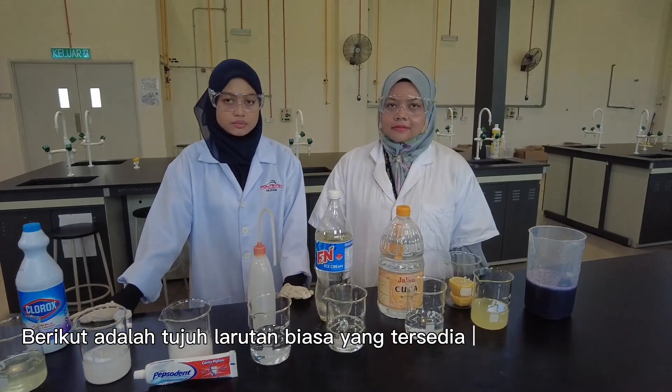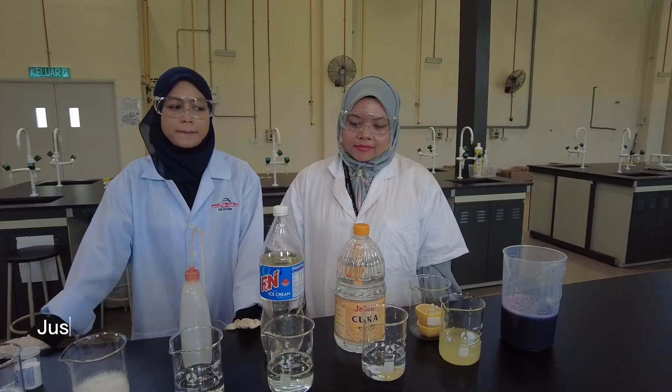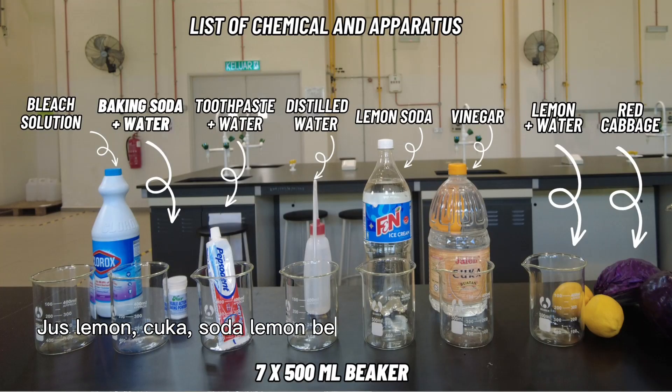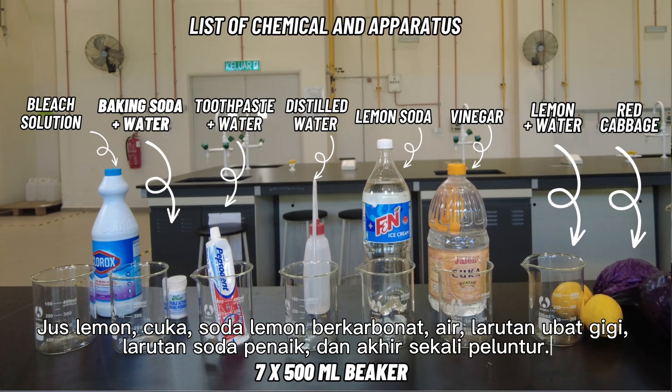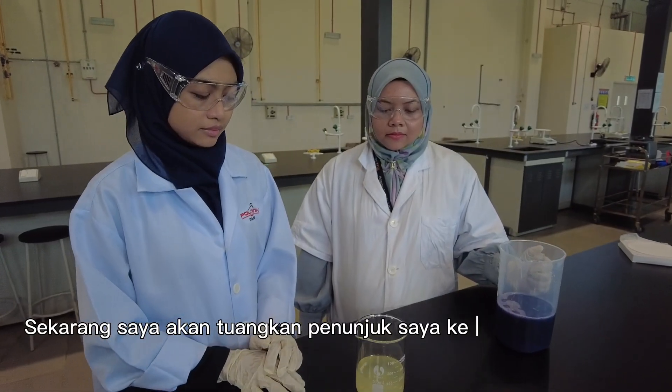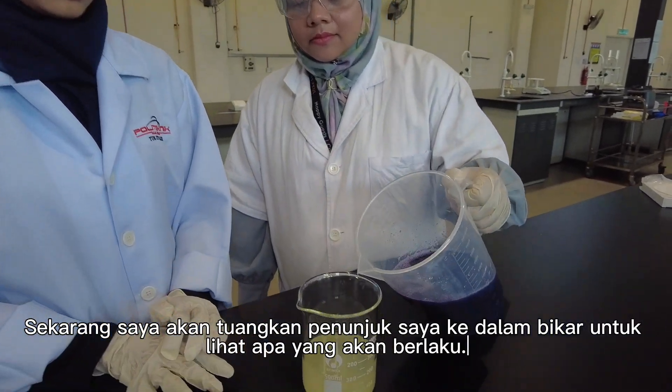Here are 7 commonly available solutions that we are going to test: lemon juice, vinegar, carbonated lemon soda, water, toothpaste and water solution, baking soda and water solution, and finally bleach. Now I am going to pour my indicator into the glasses to see what happens.